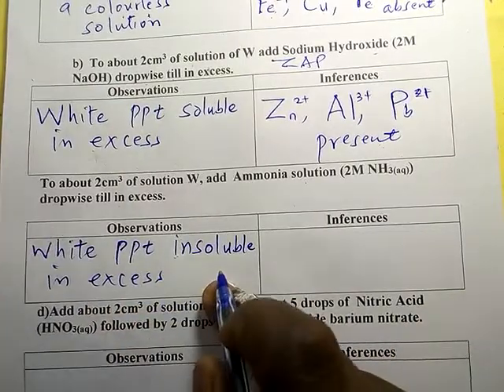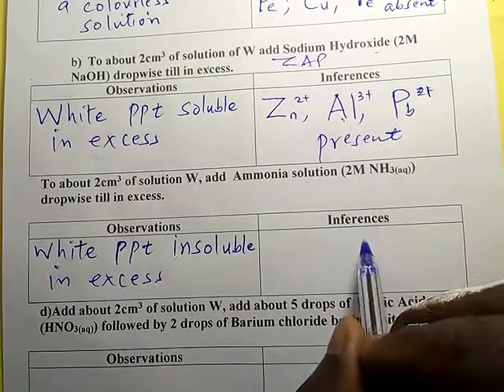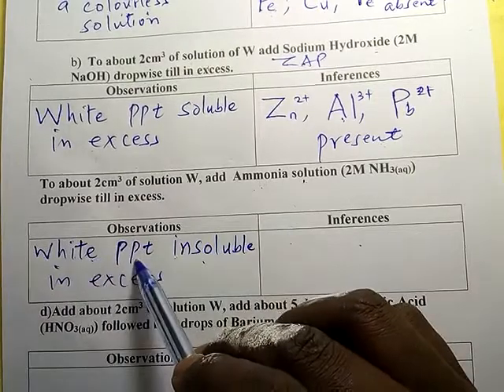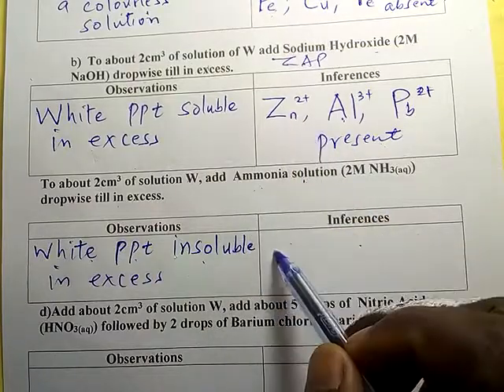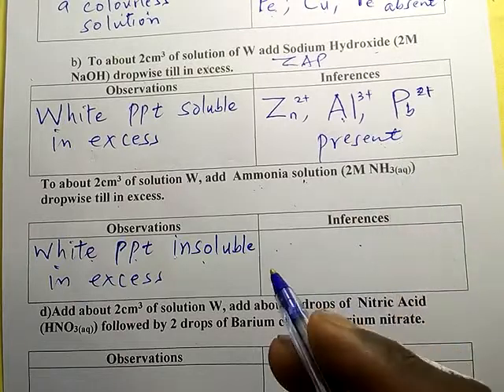So if it is insoluble, then aluminium and lead are present. If it is soluble in excess, the white precipitate dissolves to form a colorless solution. It means zinc is present. But now, since zinc is absent, what is present is aluminium and lead.